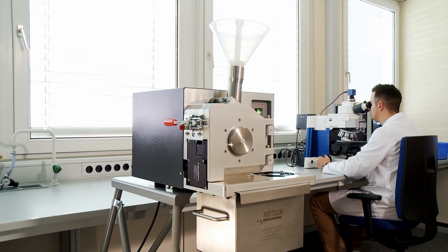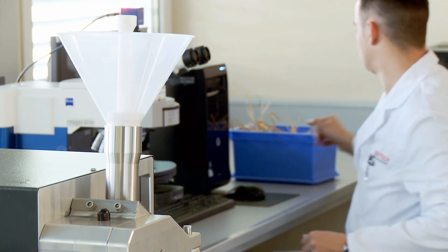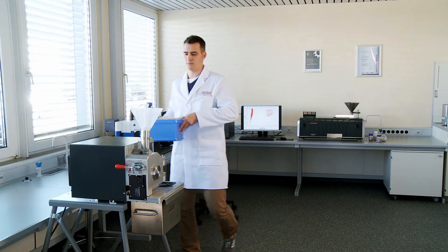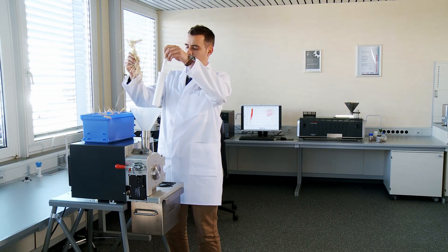Cutting mills are ideal time-saving assistance in daily laboratory work. They are suitable for size reduction of soft to medium-hard, fibrous and tough materials, plastics and heterogeneous mixtures. We will demonstrate the key points of cutting mills and how they work.